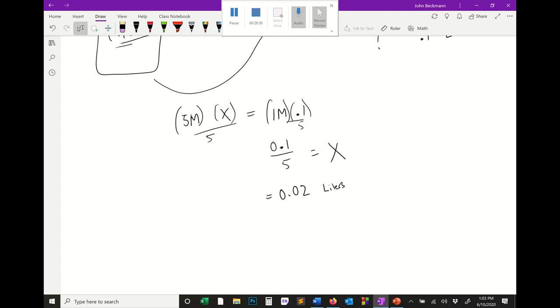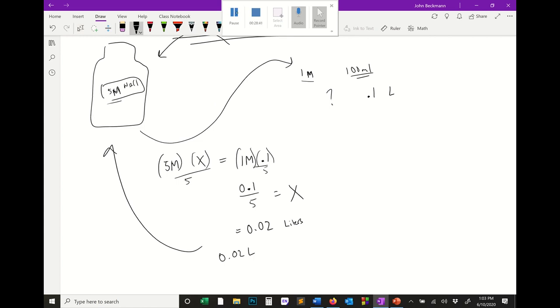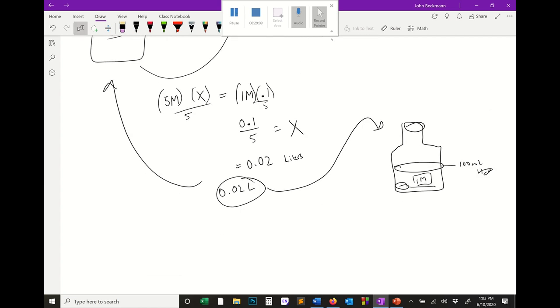So what does this mean? It means if we take 0.02 liters of our stock solution, which was 5 molar NaCl, and put that into a new bottle, it'd be just a little bit of volume, okay? And then we fill that volume up to what we wanted, 100 mils, with water, that will be our final concentration of 1 molar. Okay, and if you don't understand what 0.02 liters is, you can convert it to milliliters by moving the decimal over.